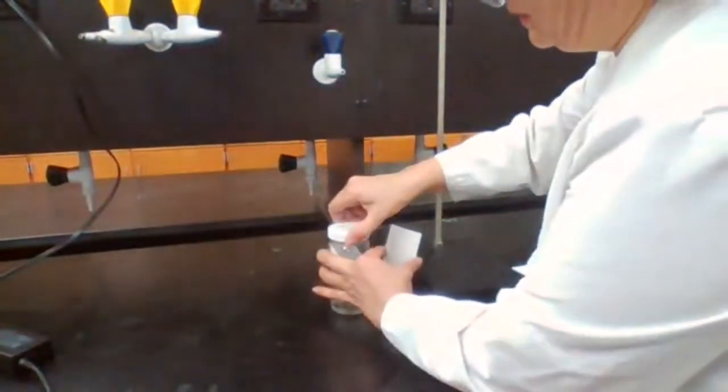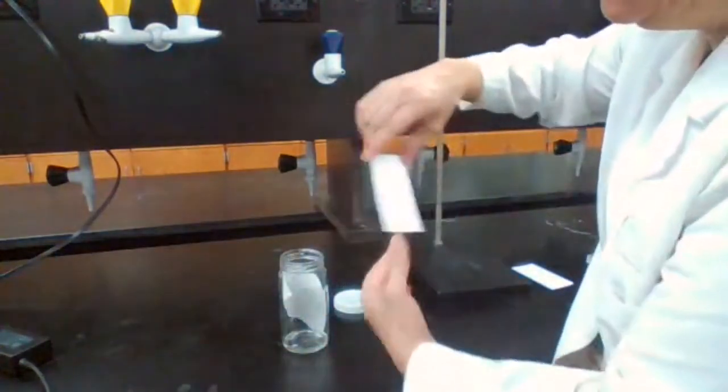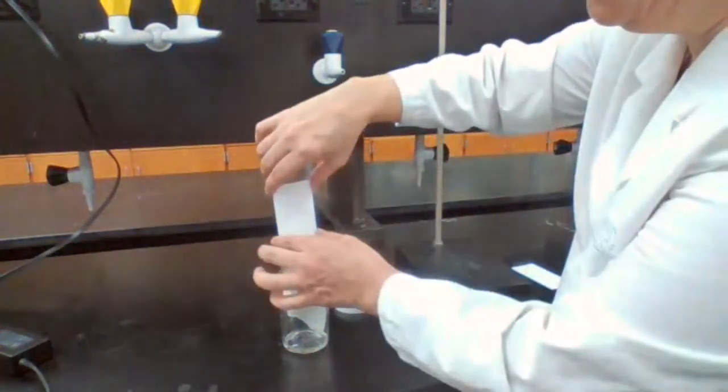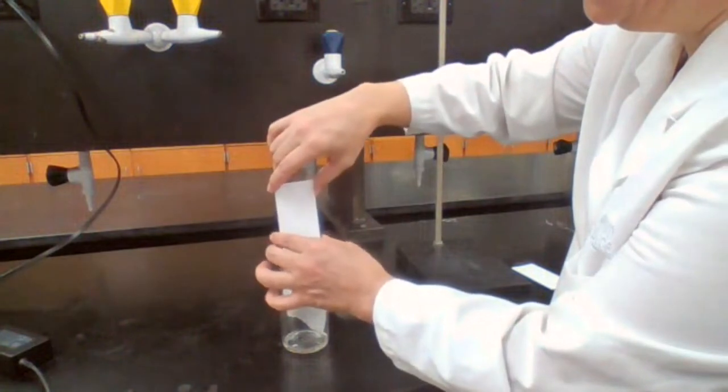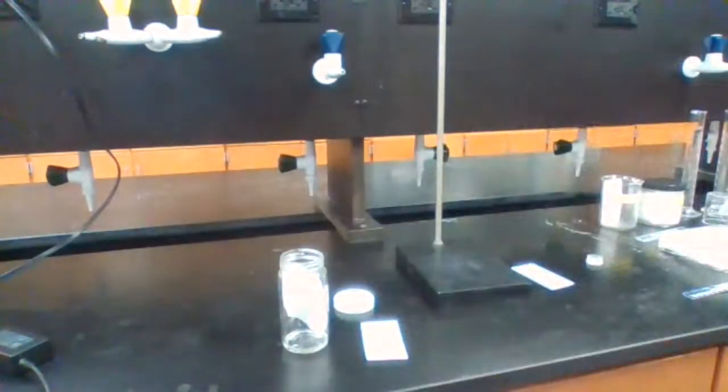I place it in the developing chamber, open the container, open the jar, and place it in. Okay, it doesn't fit and I don't want to break it.